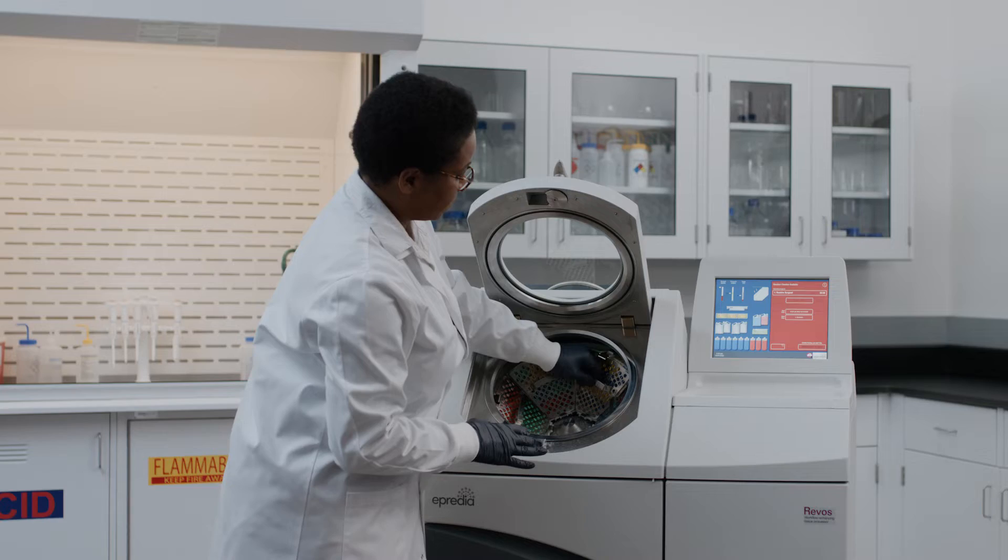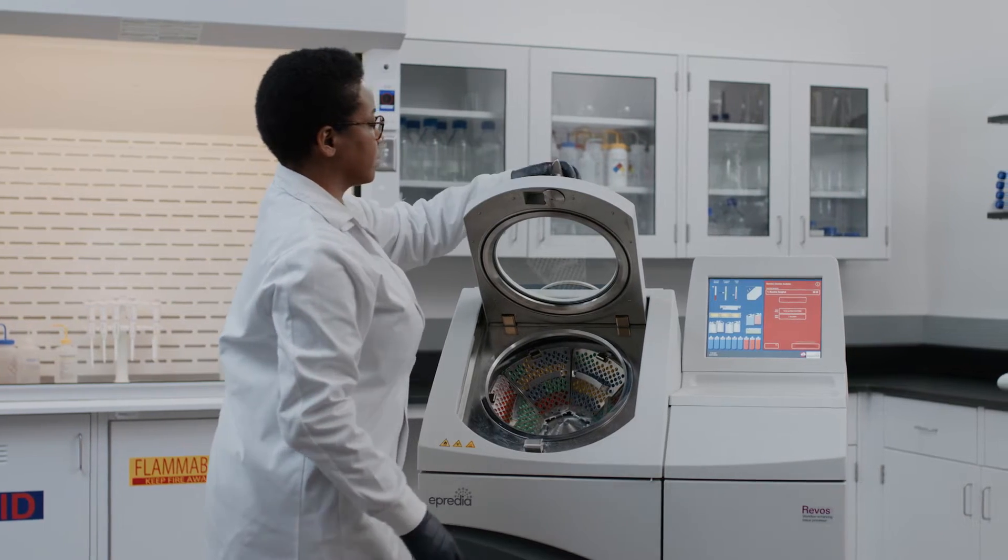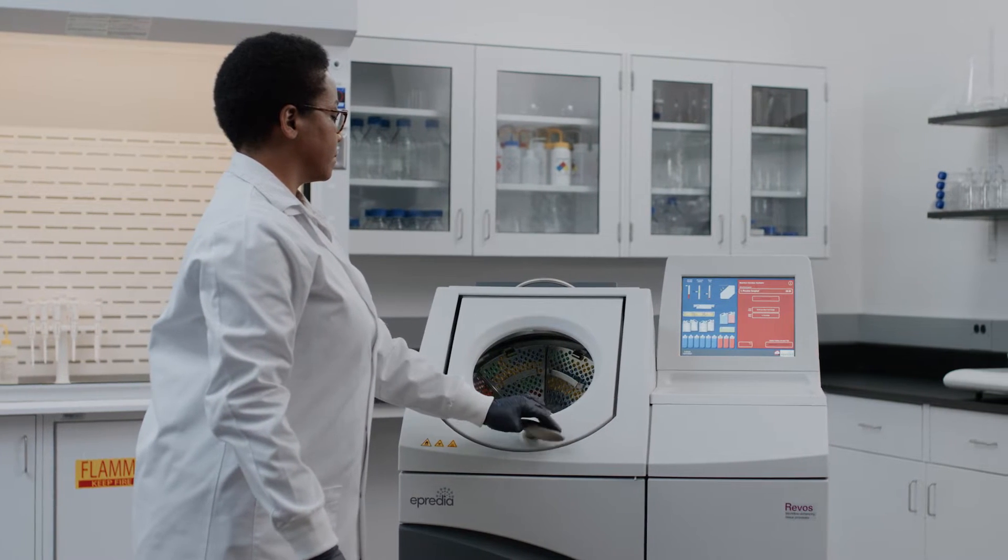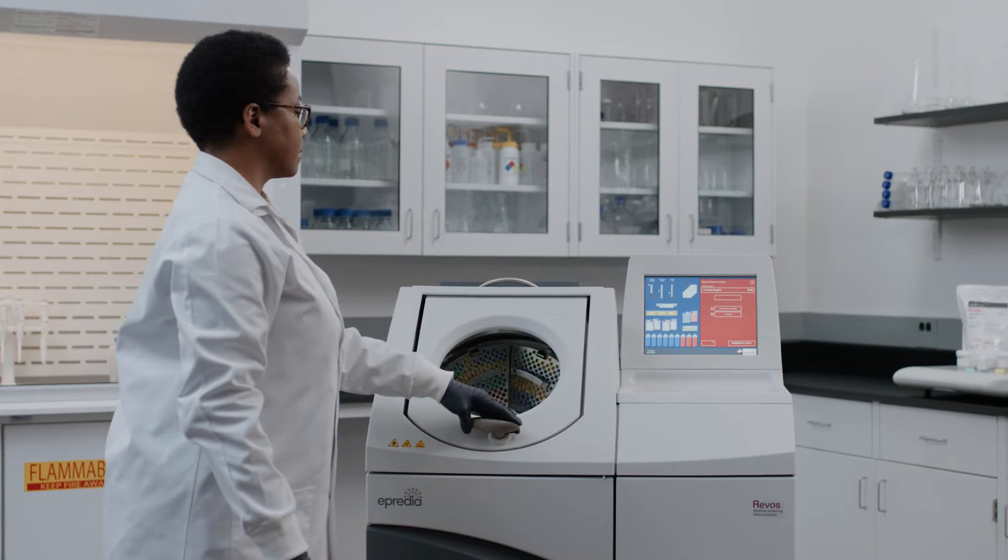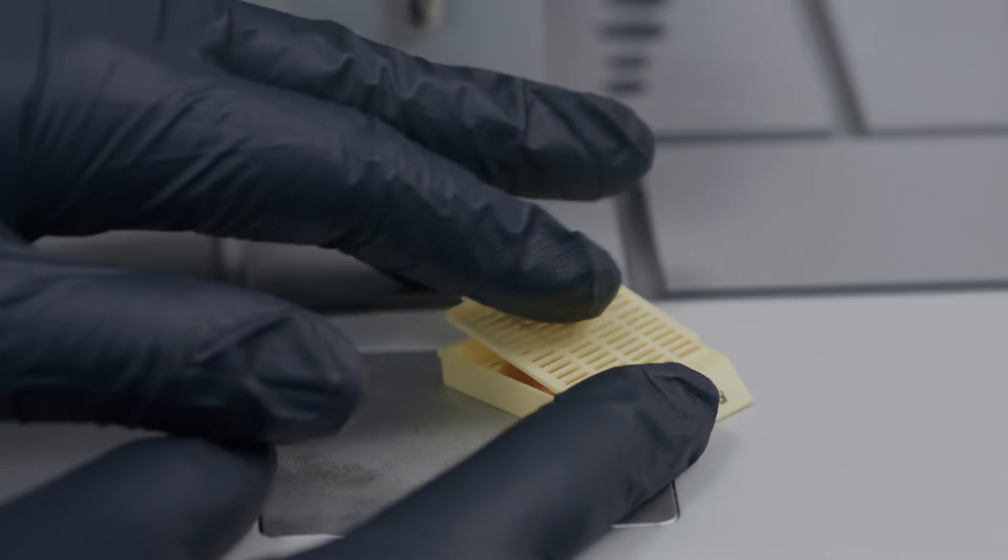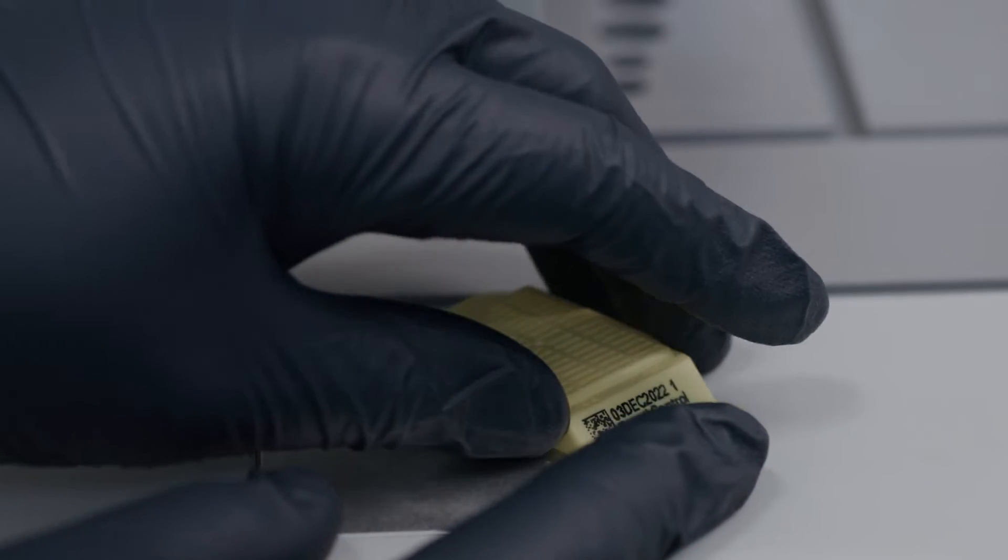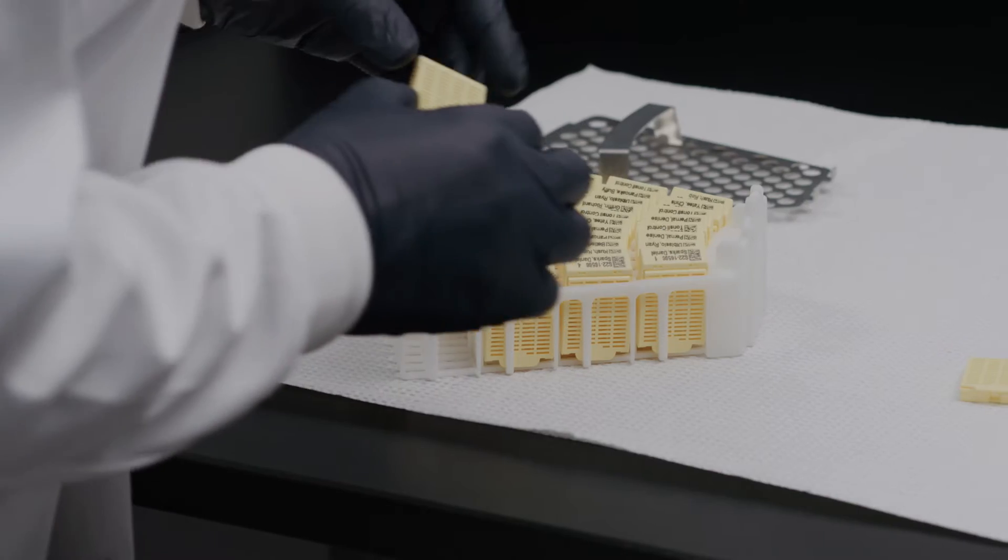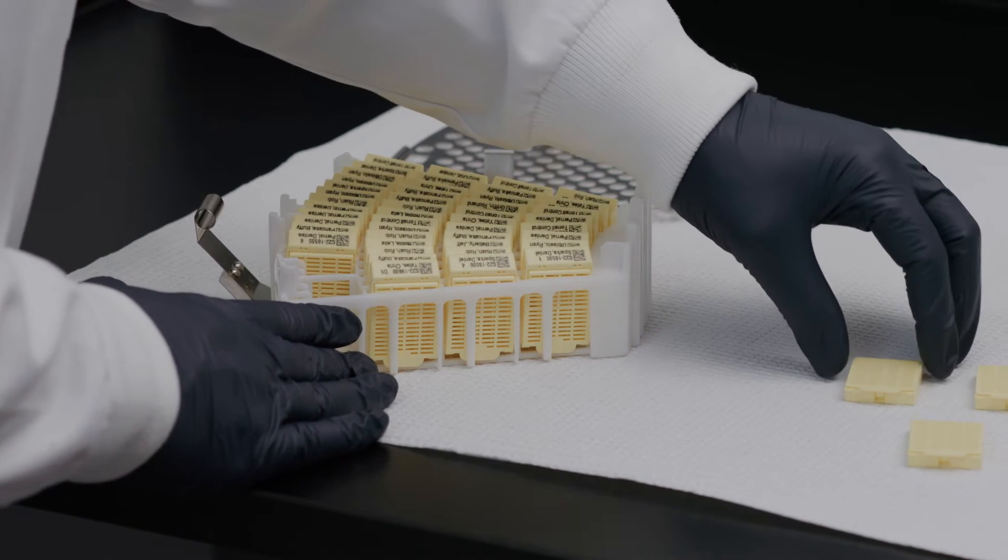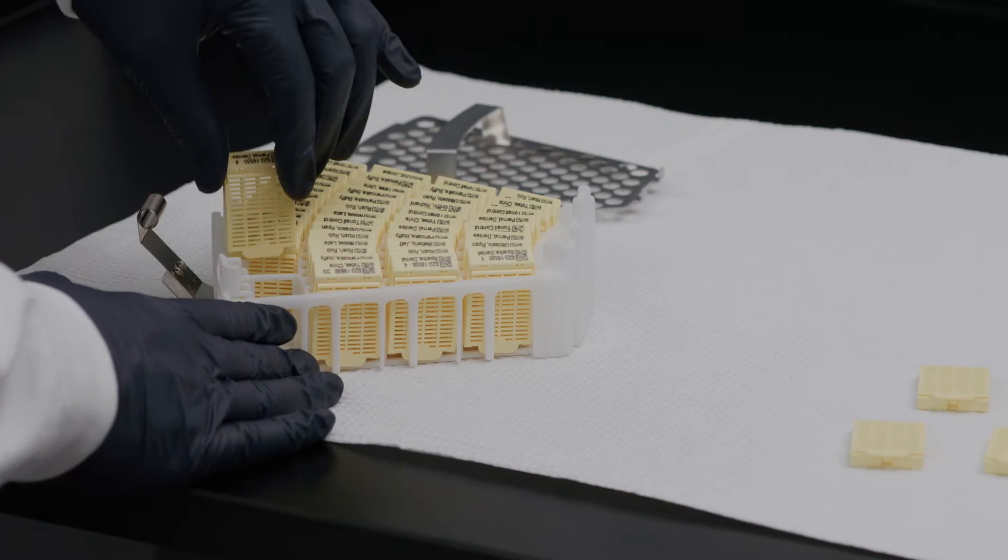The Revos system is the only rotational tissue processor on the market to offer this innovative technology, giving you confidence in your downstream processes. With the Revos Tissue Processor, your lab can process a broad spectrum of tissues without pre-treatments, saving you time and increasing your focus on patient diagnoses.